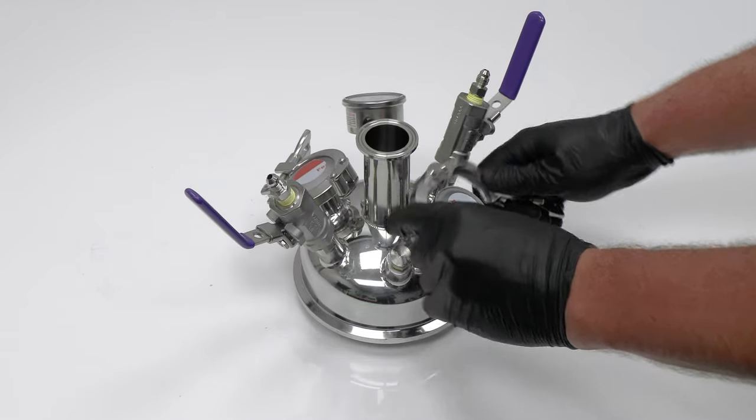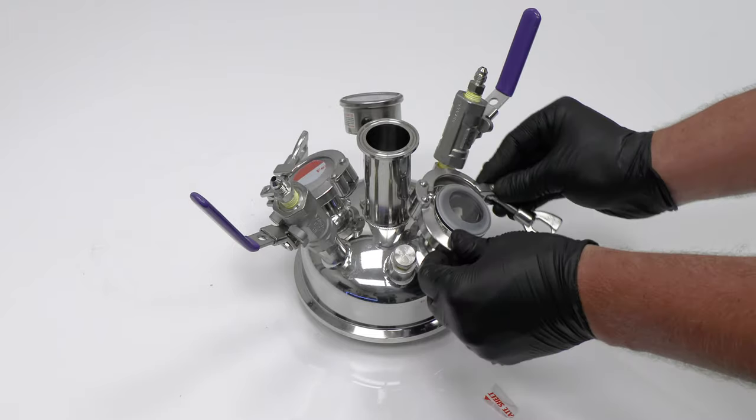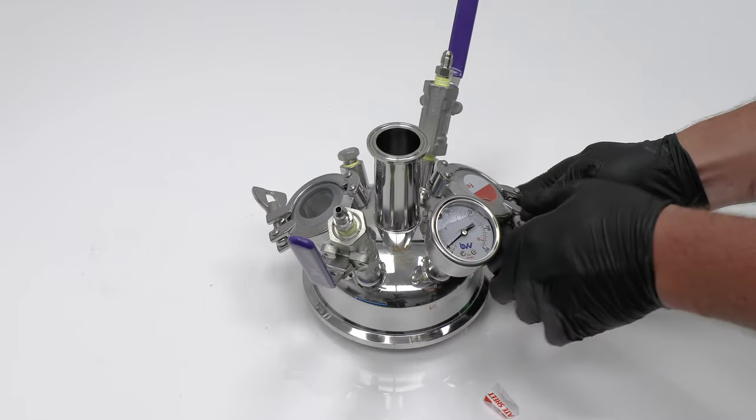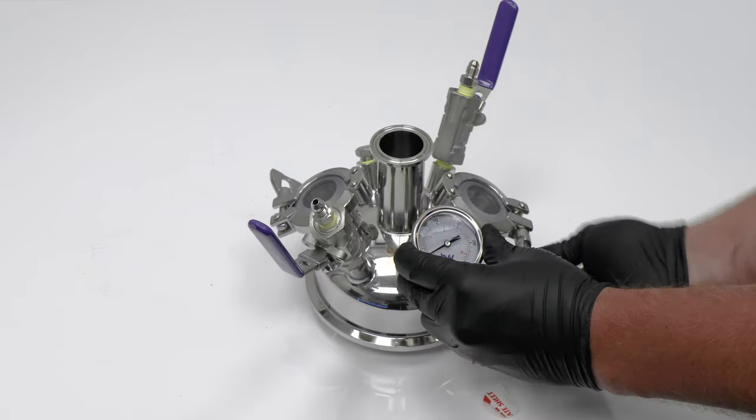How to assemble a one pound Apollo extractor. Start by removing the protective film on both sight glasses. Replace the clamps on both sight glasses.